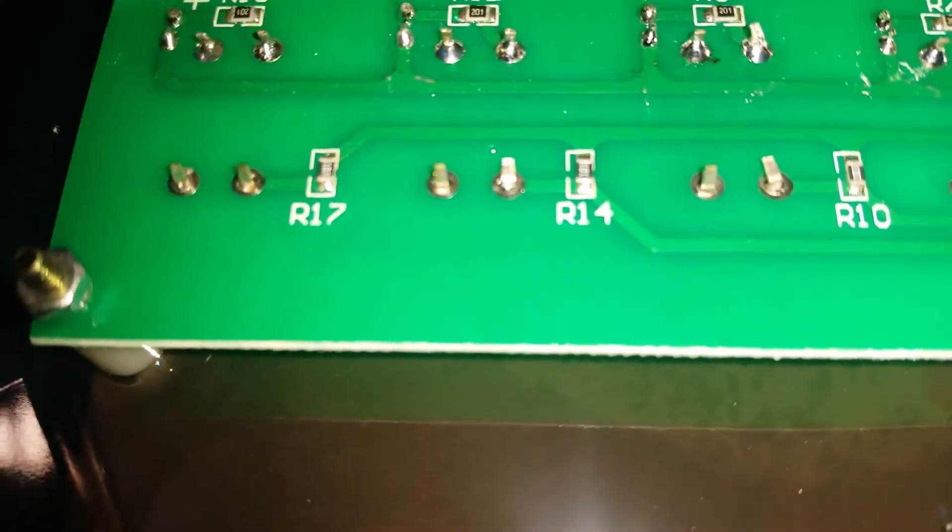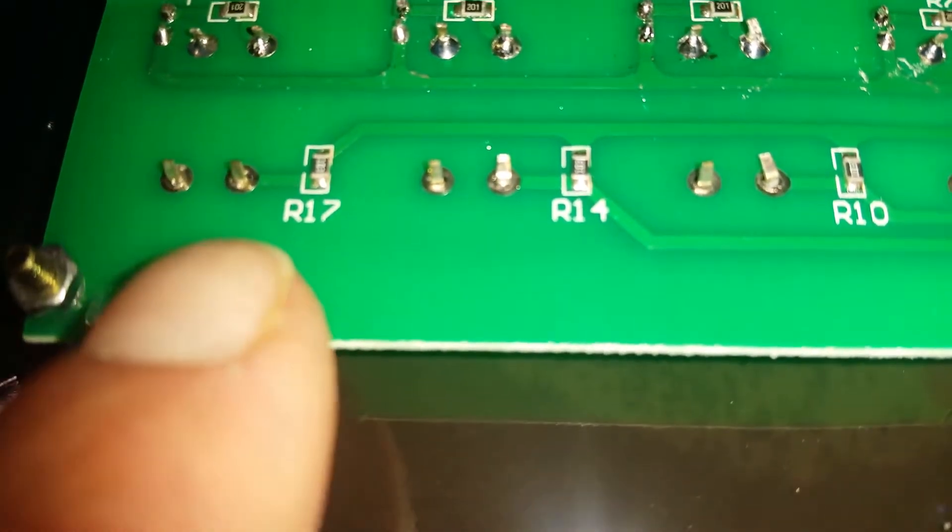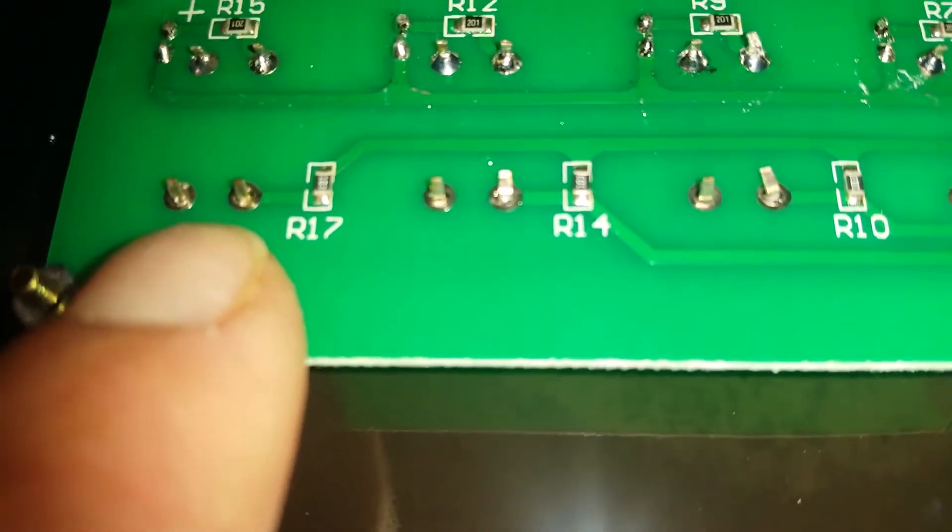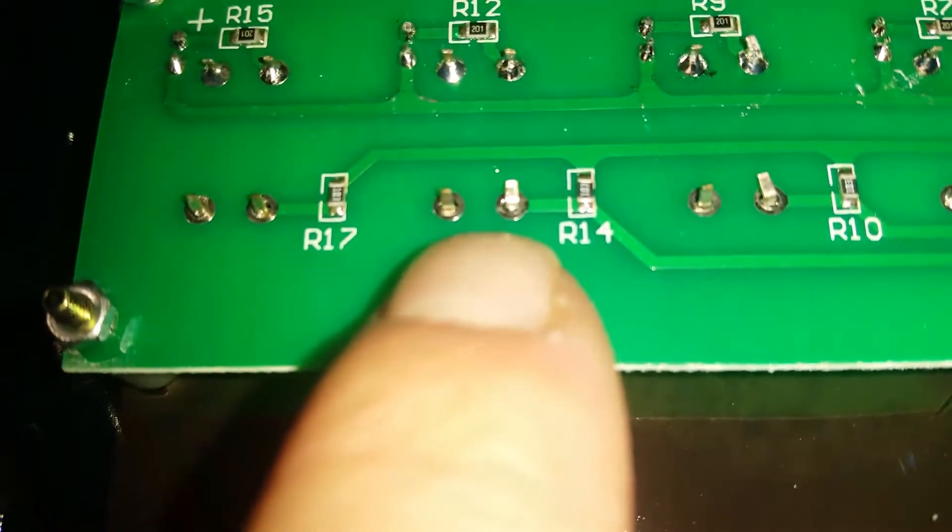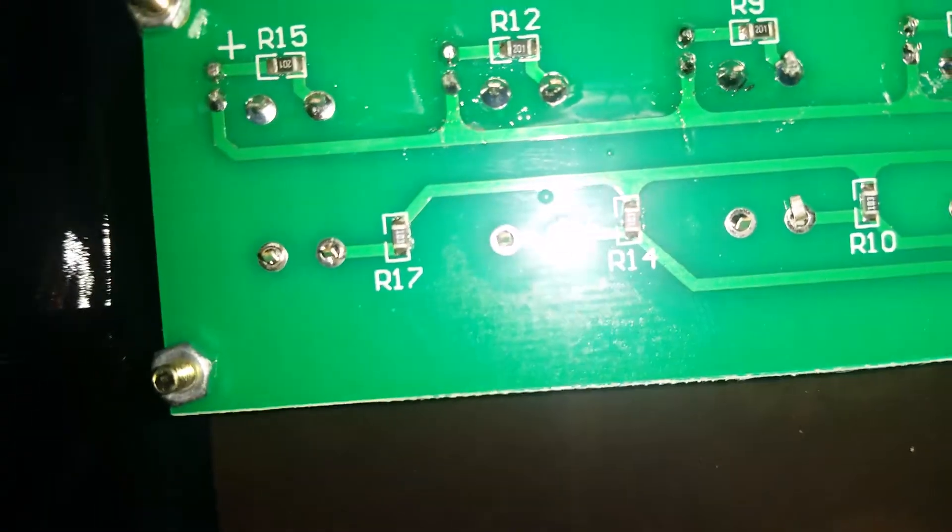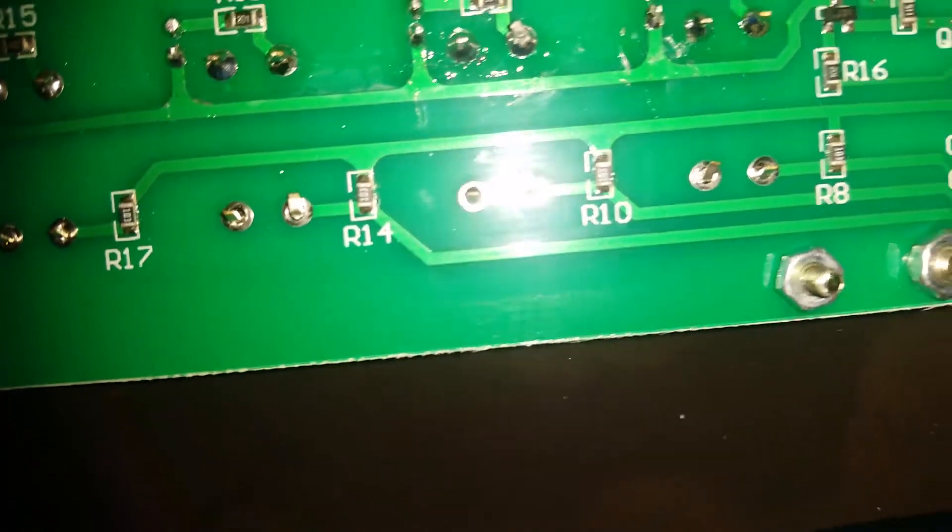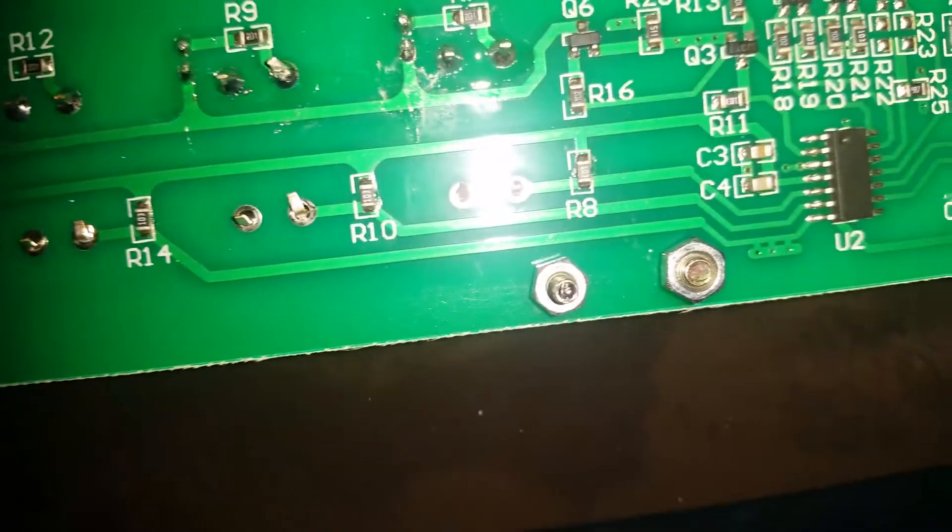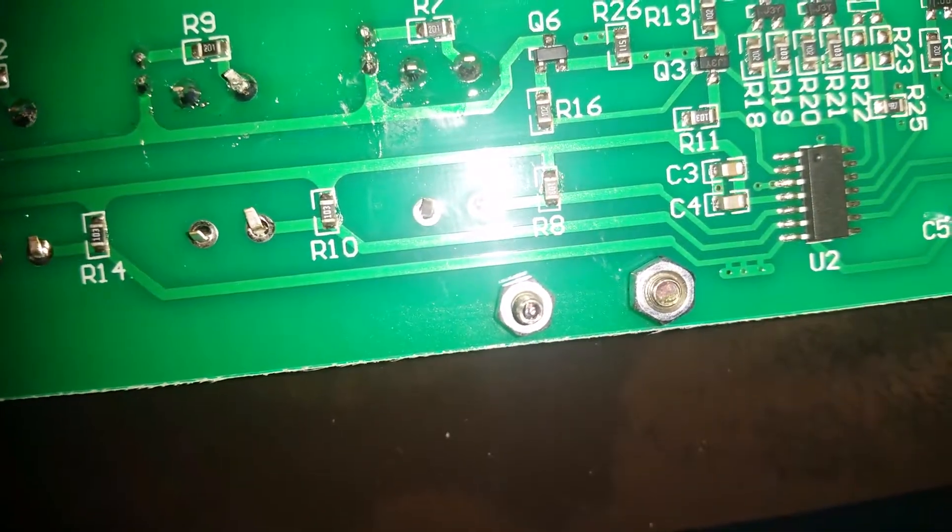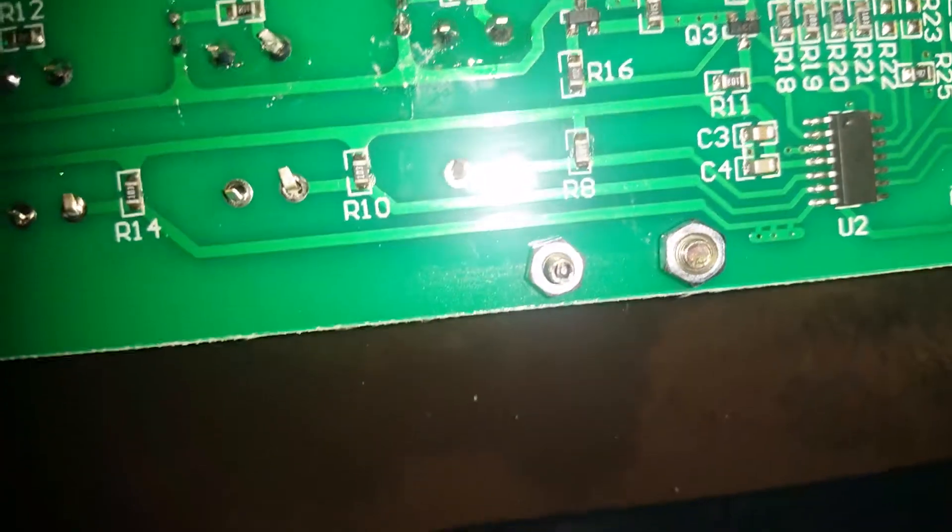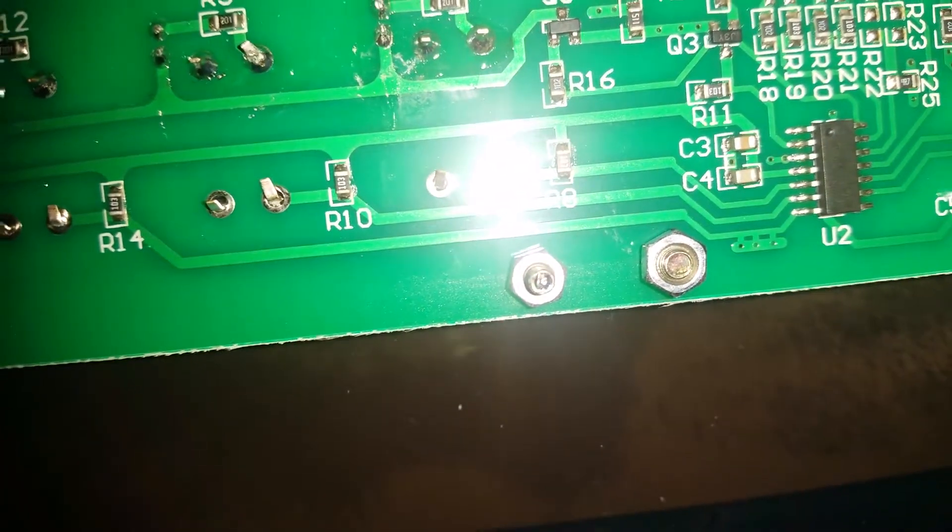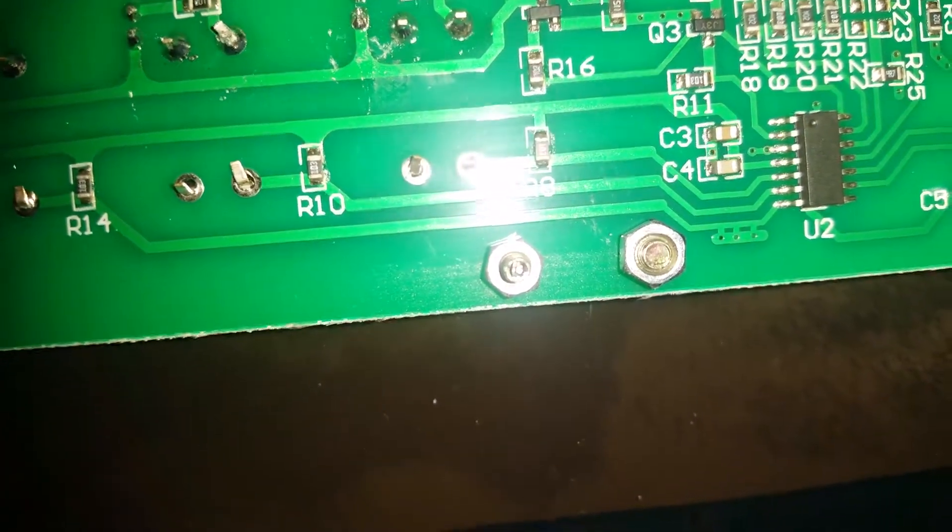But look at these bottom pins down here. The solder doesn't even fill in the holes. There are places you can see right through to the other side of the circuit board. That's a really good one. That pin right there is for the speed control, right there by the R10.